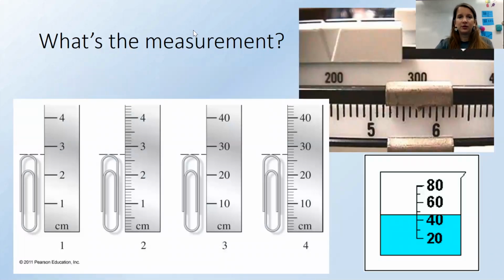So first off, don't worry about this triple beam balance here. We're not going to use triple beam balances. So, preciseness of the measuring devices. Here, you want to make sure that you estimate one extra digit, so we can only go to the tenths place. So we could say it's 2.8, you could say 2.7. Here, each line represents an increase of a tenth, so we know it's 2.7 something. We can say it's 2.71.